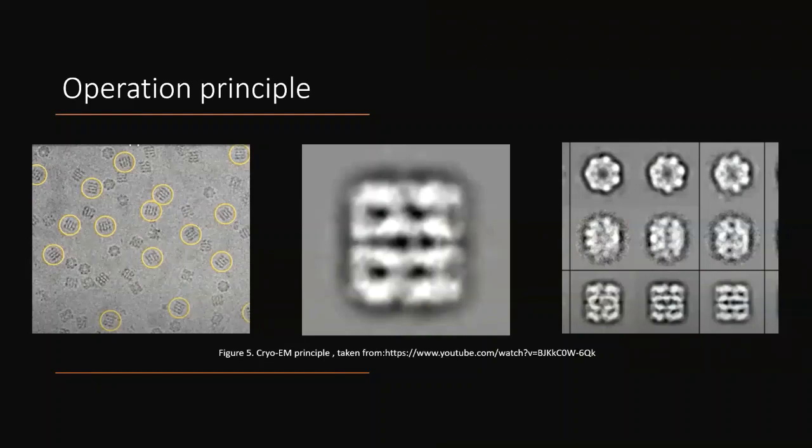A computational algorithm detects the shadows that have the same orientation, then puts all these images together into one. This process repeats for every molecule orientation. When the program has all the orientations, it compacts them into one. Finally, by reconstruction, the computer gives you a three-dimensional image.